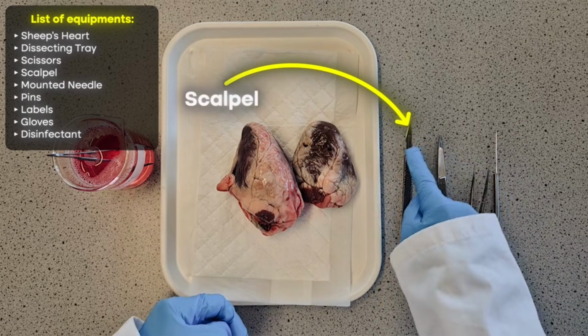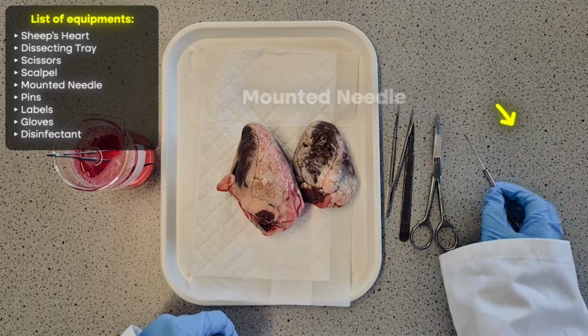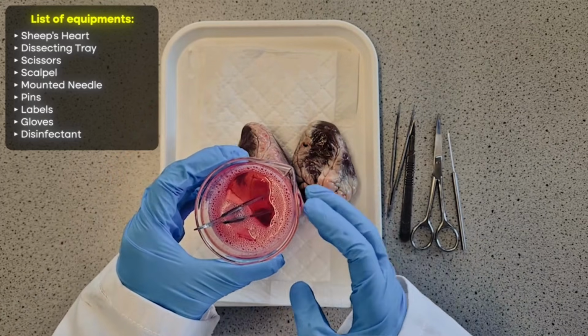We've also got a sharp scalpel. We've got sharp dissection scissors. We've got our forceps, and we've also got a mounted needle. As well as that, I've got a beaker of disinfectant. We've got Virkon, but you just need to have a disinfectant that is accepted by CLEAPSS.